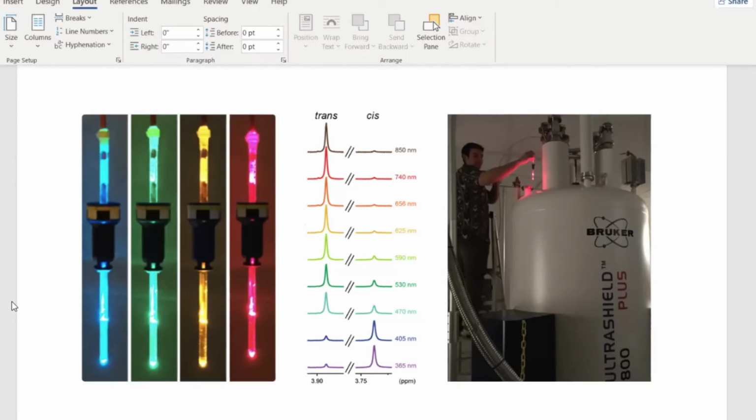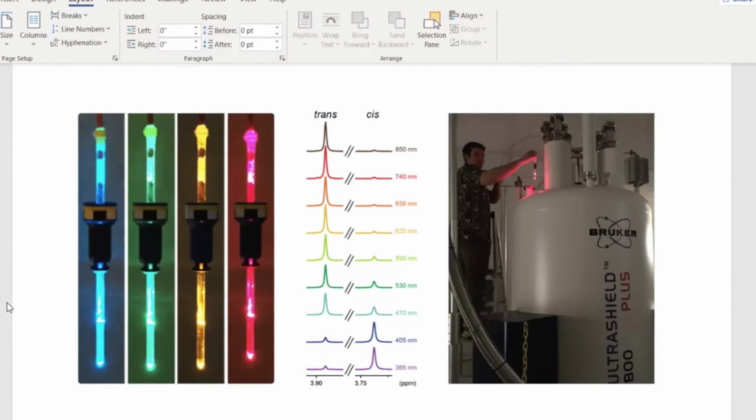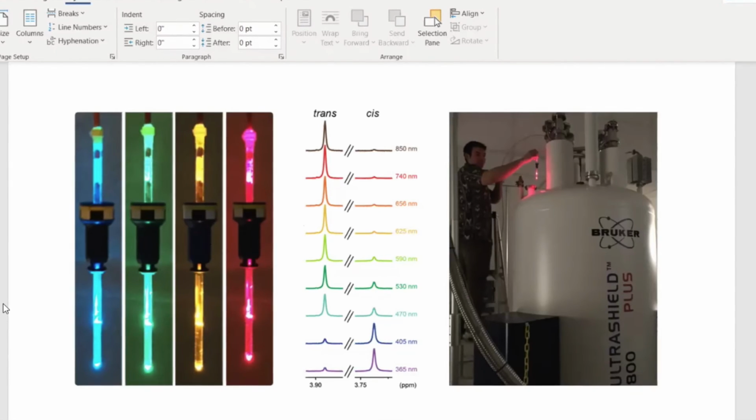Oh, wow. Great. And then lastly, just to wrap up, what advice would you give to Chemistry 219 lab students about the NMR facilities in terms of applying it to their research in the future? I think using the MedSci facilities in particular are super useful because often you'll have things with terrible resolution where different peaks are overlapping, and using these high field magnets really lets you tease that apart.